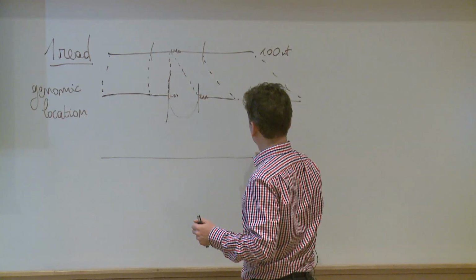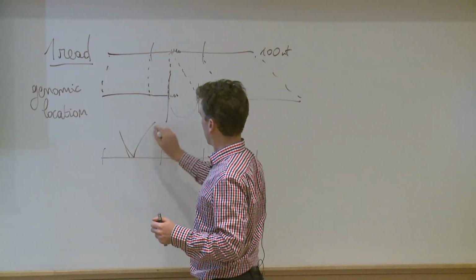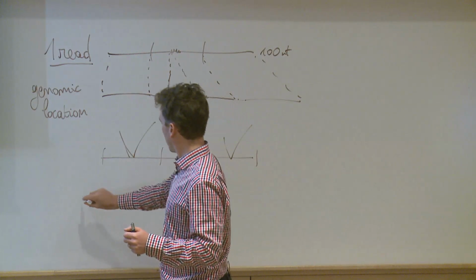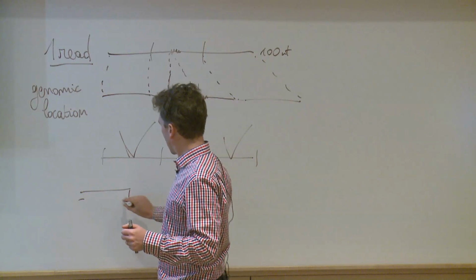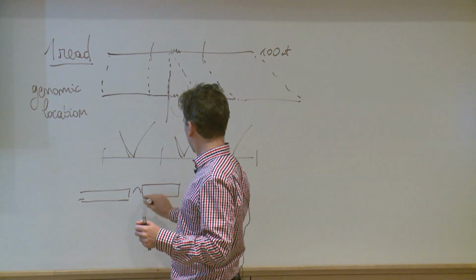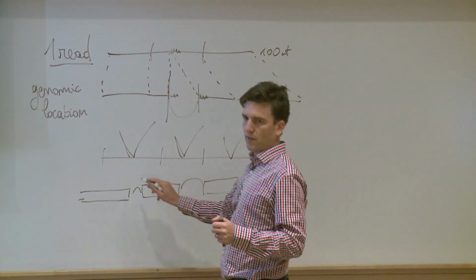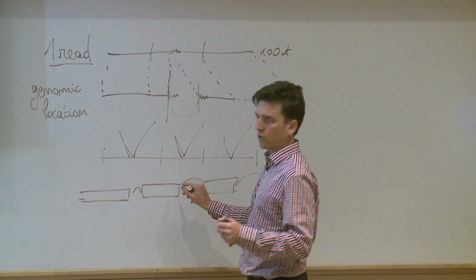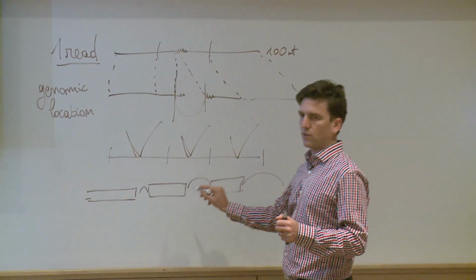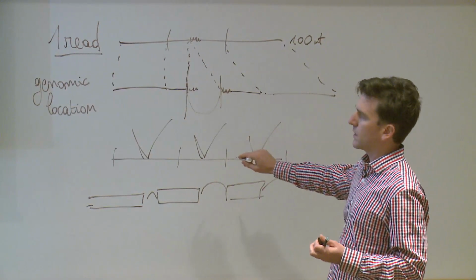The same read here. If you have a splice junction that's here, one that's here, and one that's here, first you're not lucky, but that would require a gene that's like this, then like this. So that requires exons, like two successive exons, that are not even 30 nucleotides long. You see what I mean? They're really, really small here. That's unlikely; they're so small that the probability is low. But that's probably taken into account by the algorithm.